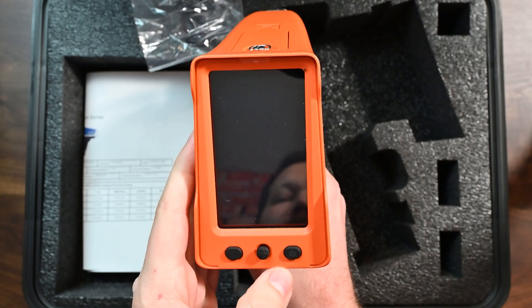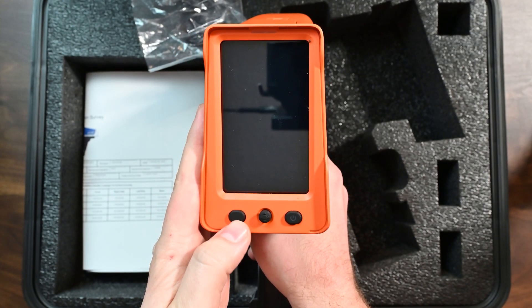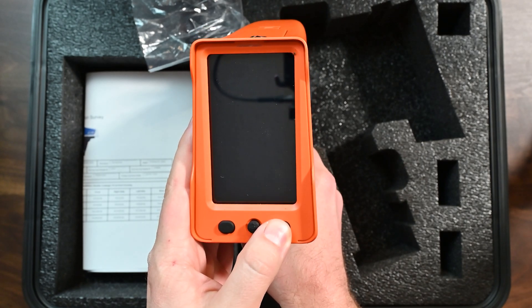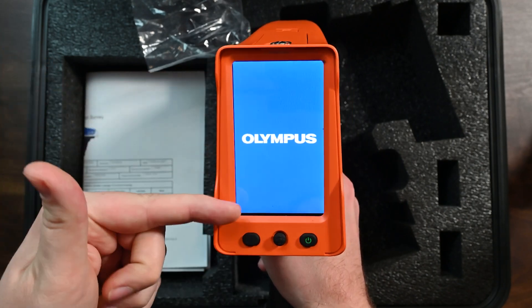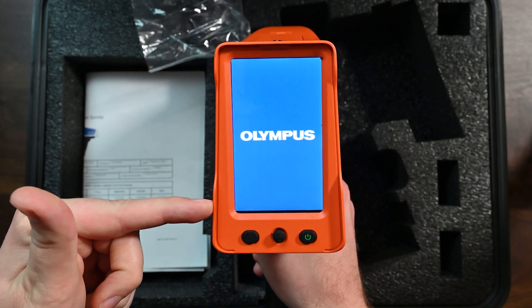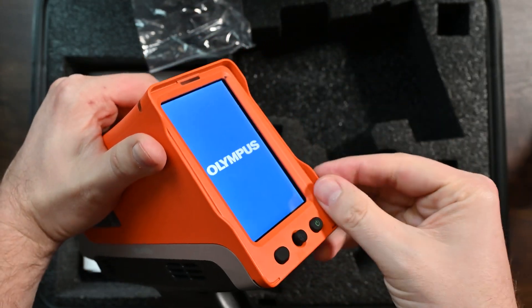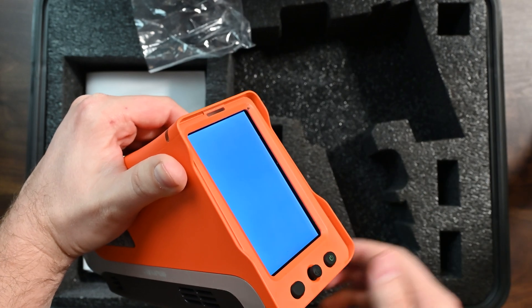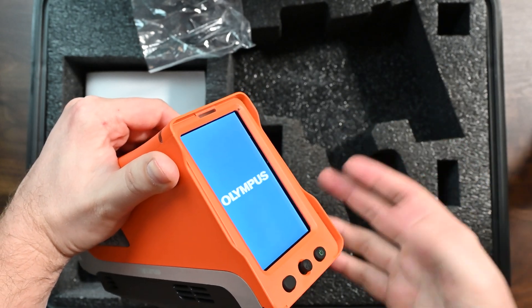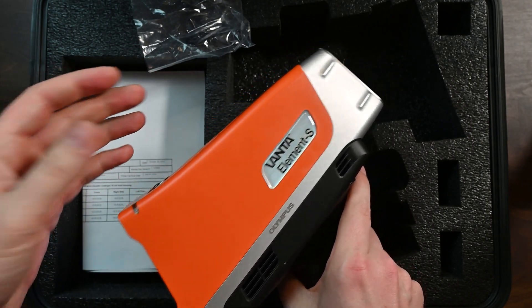It's kind of like locked and loaded. There's a power button over here, a joystick here, and another button over here. We're going to hold the power button in for just a second to turn the analyzer on. You hear a little click, and then it comes on. Look at how nice and bright the screen is and how long the screen is — I'm a huge fan of this. There are lips on the outside along with a recessed screen that's probably going to give your screen a little bit of protection in the industry, and Olympus is known to have very durable instruments.